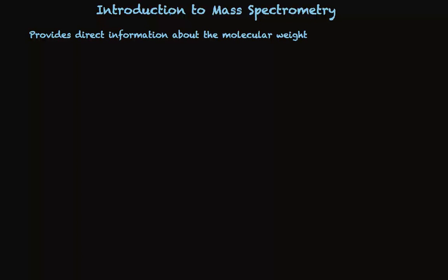It will tell you the molecular weight of a compound. For more sophisticated instruments, it will tell you the molecular formula of that compound.